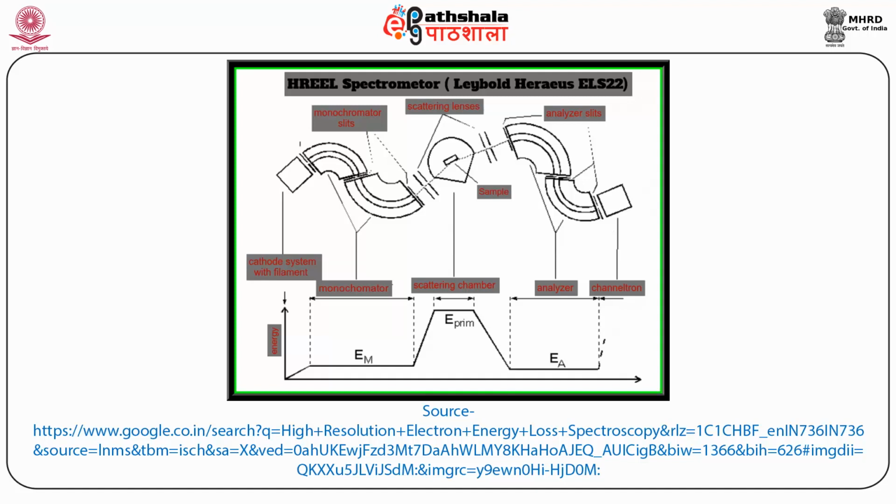In the scattering process at the sample, the electrons can lose energies from several 10 to the power minus 2 electron volts up to a few electron volts. The scattered electron beam, which is around 10 to the power minus 3 lower in flux than the incident beam, enters the analyzer; another CHA is there for the analyzer.